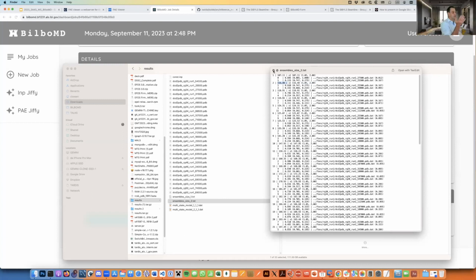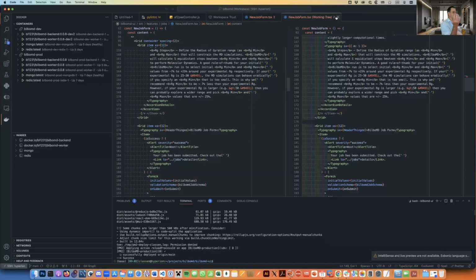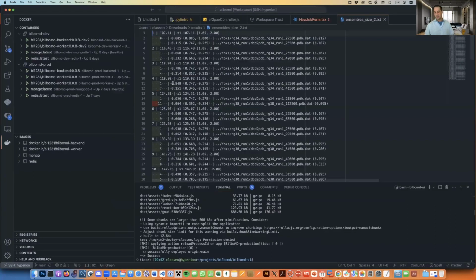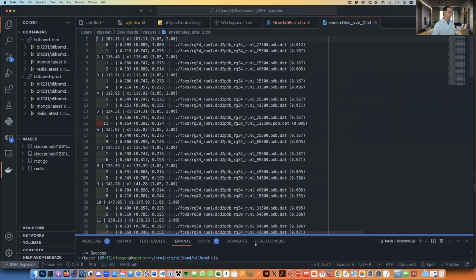So, but for now, until things are fixed, Fox will give you a clear answer. Multi-Fox will give you a clear answer. This is the output from multi-Fox. I'm saying the web version will give you a picture of your PDB. Oh, I see. Right. Okay. Data, how it looks, and the quality of the fit, and okay. So, intuitively output rather than this. Right. Okay.